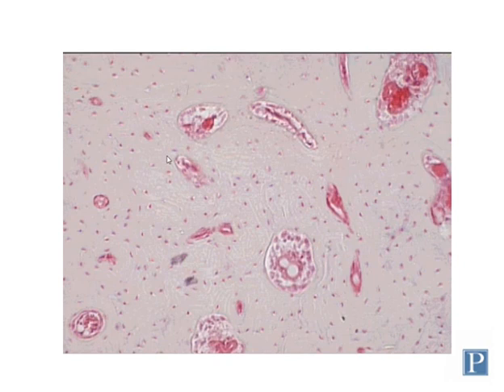So this slide shows a higher magnification view of compact bone prepared by the decalcification method. And you can notice that there are these circular canal structures. Some of them are large in diameter, like these. Others are smaller in diameter. These are called central or haversian canals. And again, these are often filled with blood cells that you can see here because there are blood vessels and nervous tissue that pass through here.